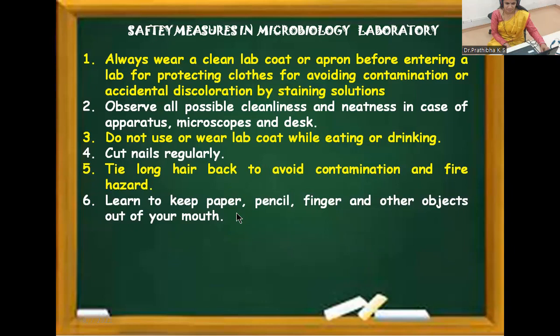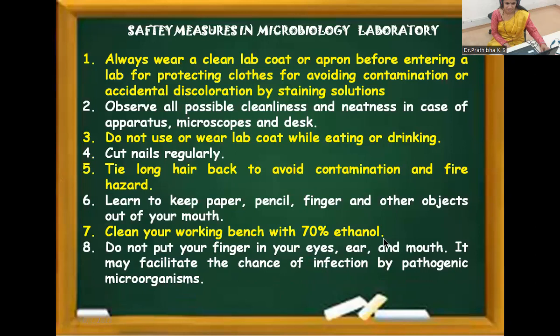Learn to keep paper, pencil, finger, and other objects out of your mouth. Clean your working bench with 70% ethanol, that is a surface sterilizing agent. Do not put your finger in your eyes, ear, and mouth. It may facilitate the chance of infection by pathogenic microorganisms. Okay, whatever instruction I have given here, kindly follow these instructions in your laboratory while working.